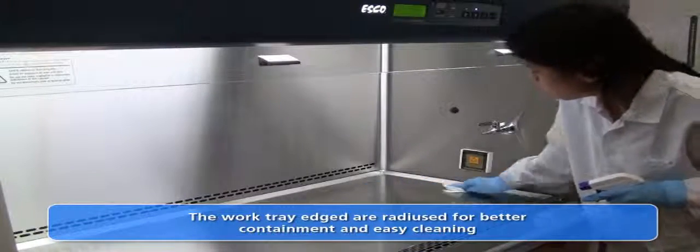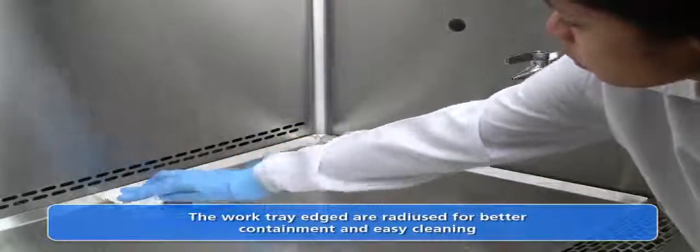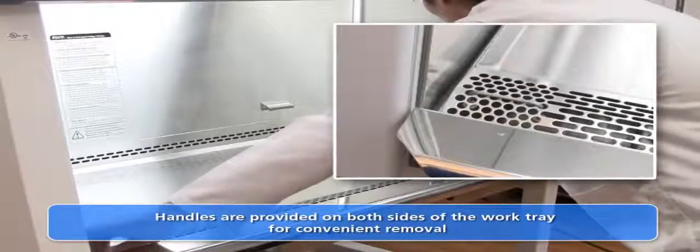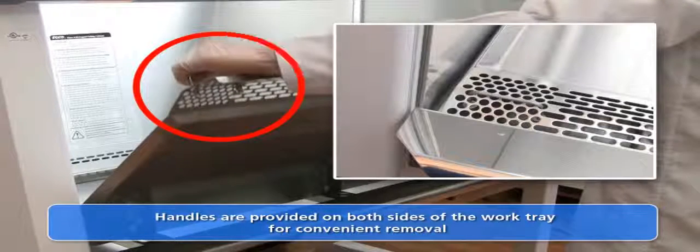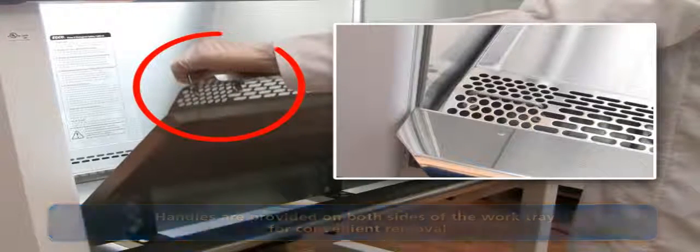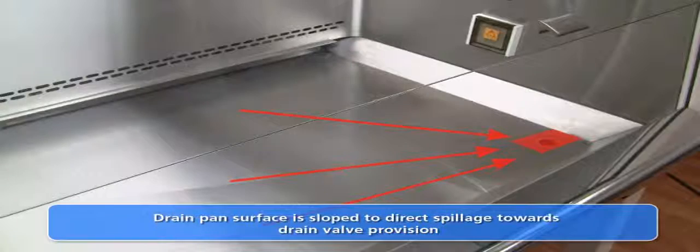The work tray is radiused at the edges for better containment of spillages and allows for thorough cleaning. A small handle is provided on each side of the work tray for convenient removal. The drain pan is a single piece which permits easy cleaning with no hard-to-reach corners. The drain pan surface is sloped downward to direct fluid spillages toward the drain pan valve.